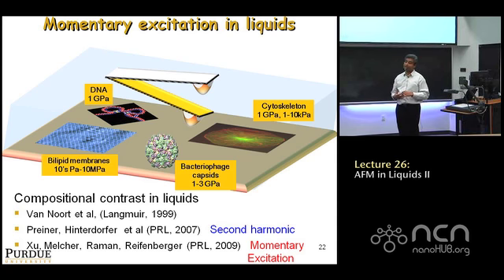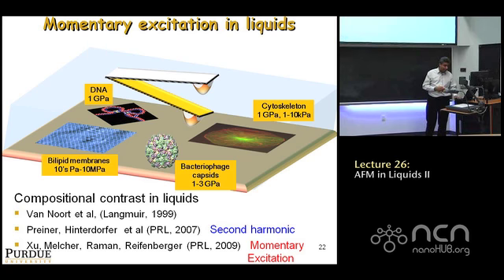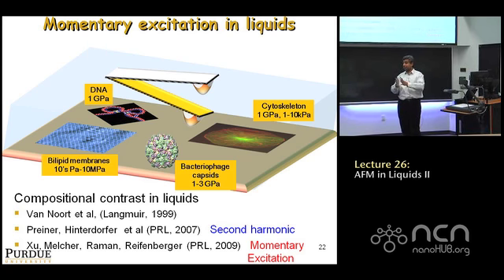So this is an important property to map out, first of all, because you have a very wide variation of this property in biological samples. If you can map this, it's a good tool for doing assays. You always want to choose a property that has a lot of variation over the population you're imaging. If you're trying to map a property that doesn't change much over a population, it's not very good for doing assays. So stiffness, elastic modulus, is a good one to map in biology, not only because it has a very wide range, but also because these days people are becoming more aware of the importance of mechanical properties in biology itself. So there's interest in the topic itself, plus this property changes by a very large margin over different kinds of samples.